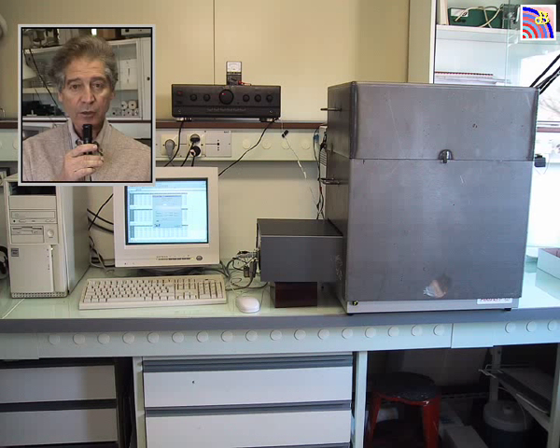On this final view, you are looking at the machine as it is in real life. It is shielded behind an iron shield that encaged it completely so as to protect it from electromagnetic unwanted electromagnetic fields. We have two machines like that. The second one will be moved from lab to lab, and we expect even to be able to buy a third one. One of them should be put in a lab in the UK, the other one in the United States, and then we expect these experiments to be replicated in several high-level laboratories all over the world.